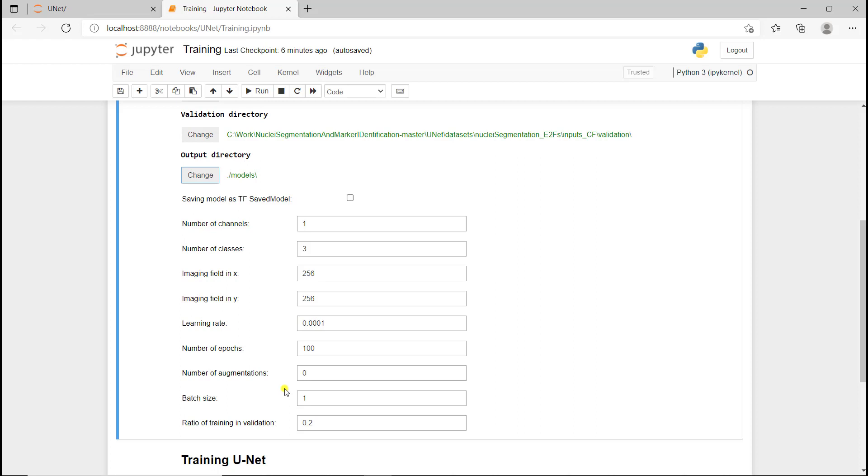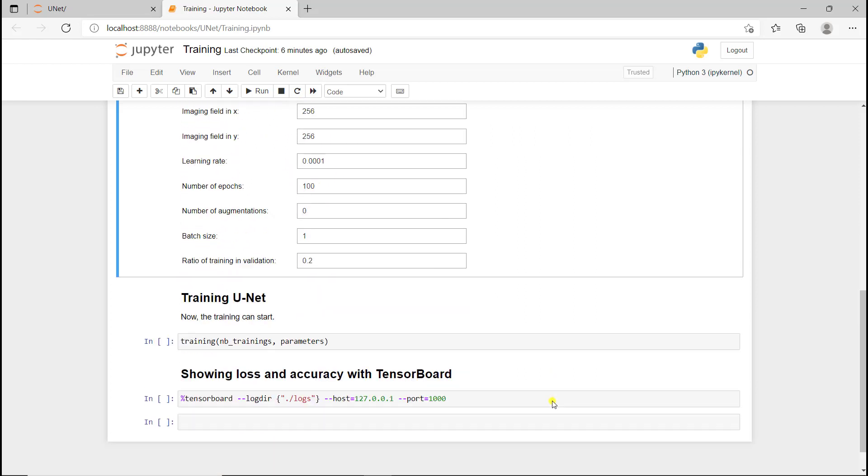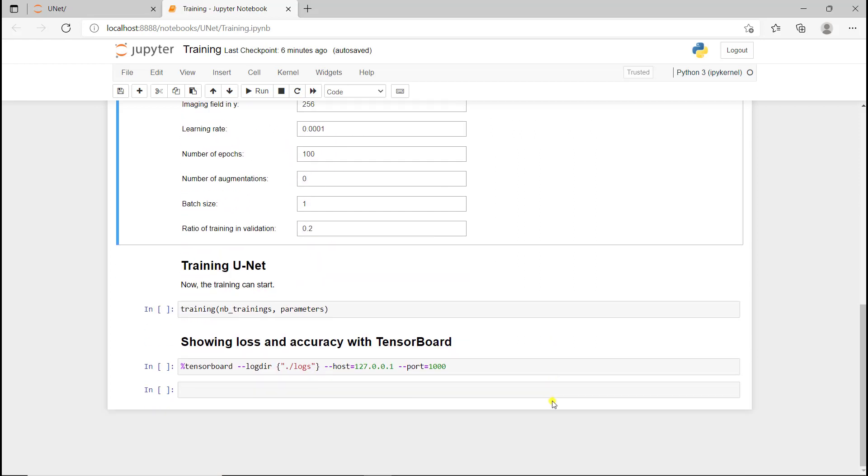Finally, we can change the batch size, but I don't have a very powerful GPU here, so I'm going to keep it to one. This parameter we saw: if you don't have a validation directory, it gives you the amount of data you put in validation from the training.